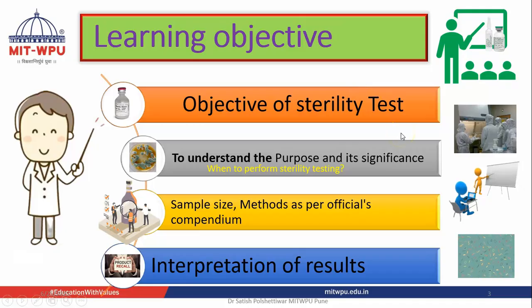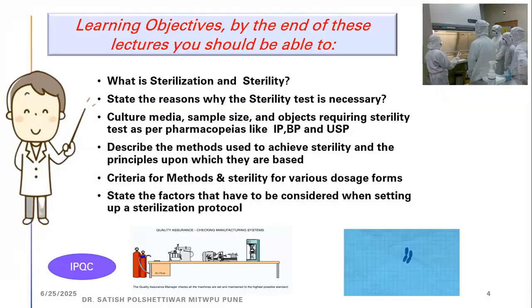So what is the learning objective? Today we are discussing the objective of the sterility test, to understand the purpose and significance. Then we will discuss sample size, method as per official compendium, and finally we'll discuss interpretation of results. That's very important for any subject.